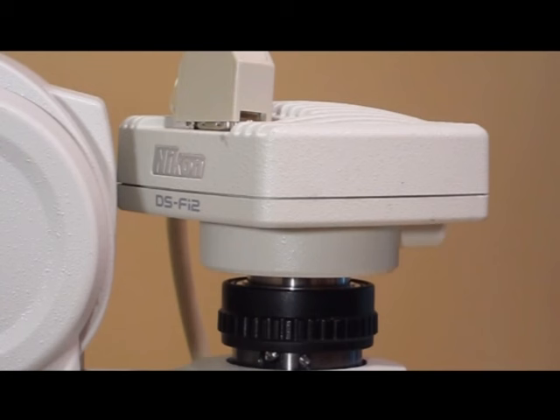It's a 5 megapixel camera that can be switched to record 1.3 megapixel images as well. A 1.3 megapixel setting matches most computer screens pixel for pixel, allowing for optimum size images that can be saved as bitmaps, TIFFs, or JPEGs.